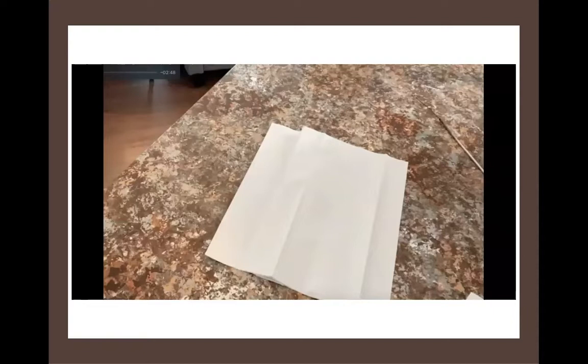Now let's take a look at the next kind of transfer, which is from a broth tube to an agar plate. Remember, we use plastic single-use Petri dishes in the microbiology lab, and we can pour agar into those dishes and allow it to solidify, giving us a solid media to work with. We refer to those as agar dishes or agar plates. The agar, the solid material, has nutrients added into it so that the bacteria can grow.